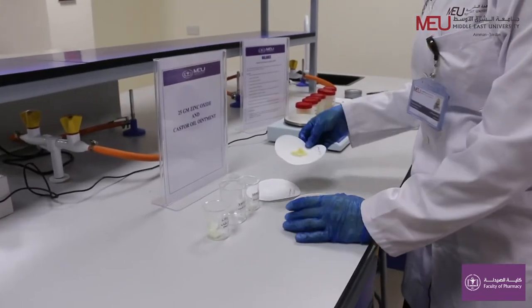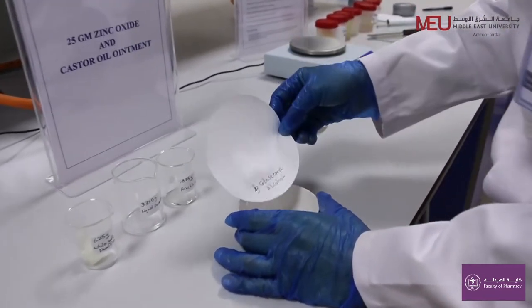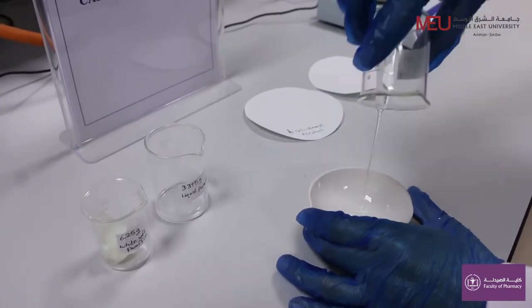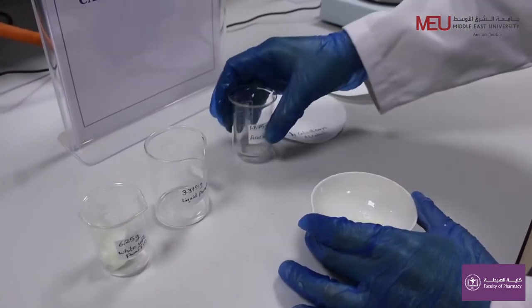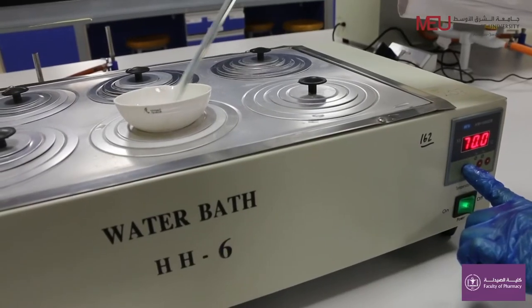Add all of them together in the evaporating basin. Melt them together using a water bath at 70 degrees Celsius.